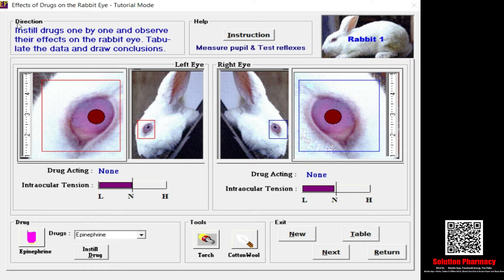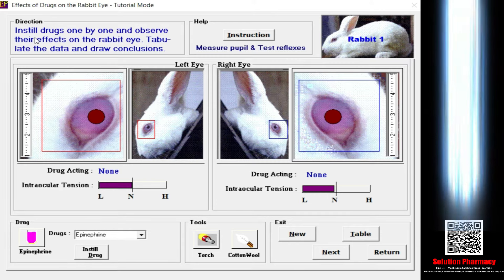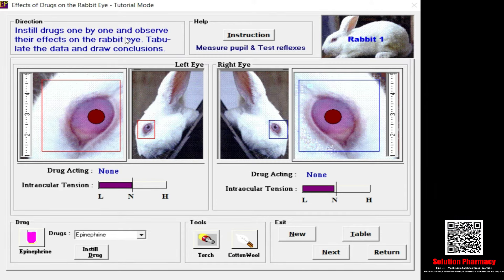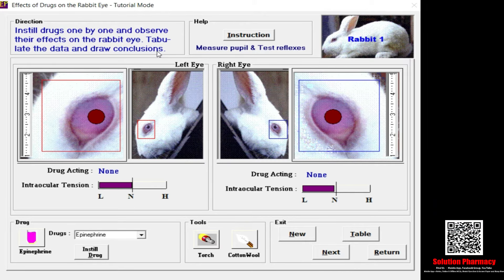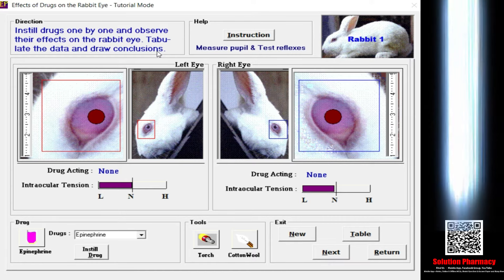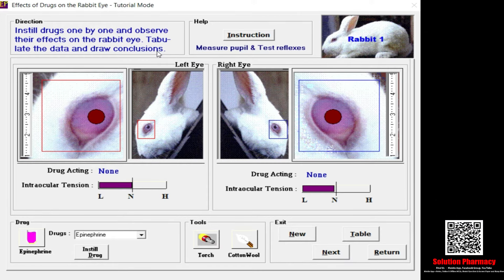First let me explain the directions tab. In the directions tab you can easily understand that you instill drugs one by one and observe their effect on the rabbit eye, tabulate the data, and draw the conclusion. We have to select the drug, then instill the drug, then administer it into the rabbit eyes one by one. At a time you can instill only a single drug in a single eye of any rabbit, but if you want to study the effect of two drugs simultaneously, you administer them in the right or left eye respectively.